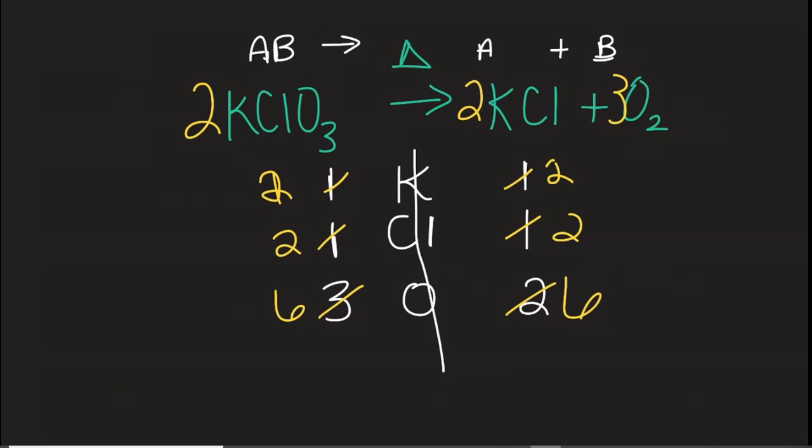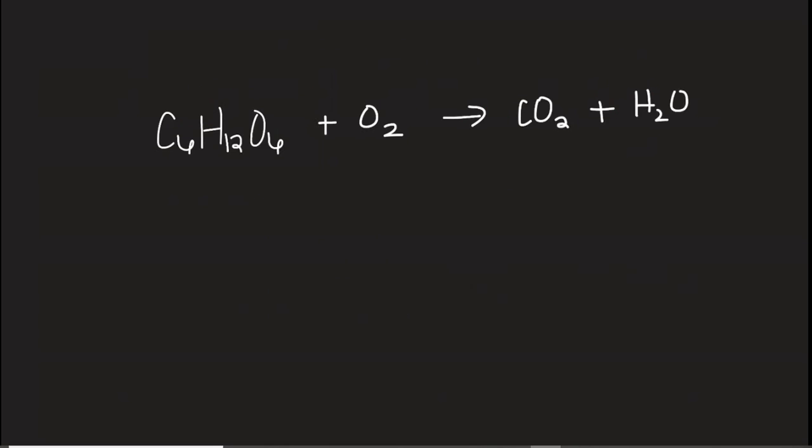The other one that we're going to be looking at, this is the second part of it, right? So after we've melted that and we have a tube full of liquid, we're going to be dropping our gummy bear, as indicated by our glucose right here, into this tube full of oxygen. And with that heat, it's going to combust, right? And we're going to get our little fire over here, okay? All right, so looking at the balancing here, oh, sorry, I guess I should also say, this is our fuel plus some oxygen always makes that CO2 plus water. And that is what's telling us that this is a combustion reaction, okay? So you're going to need that for one of your questions.